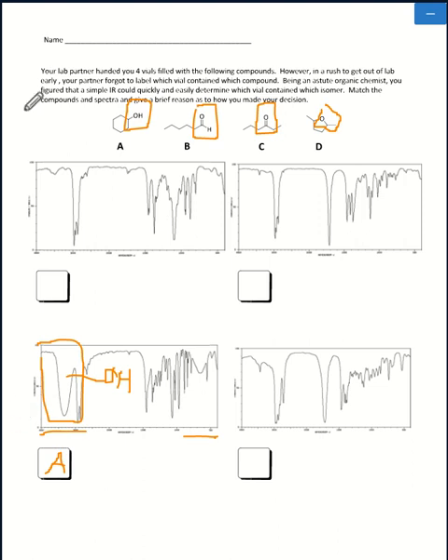Now, when it comes to ketones and aldehydes, that C double bond O will show up around 1700 on the IR. So effectively, let's look for a very narrow, very steep peak around 1700. While it will be more clear to see the numbers on the worksheet in front of you, I'm just going to refer to what I know. Essentially 1700, though the numbers are small on the screen, is around the middle.